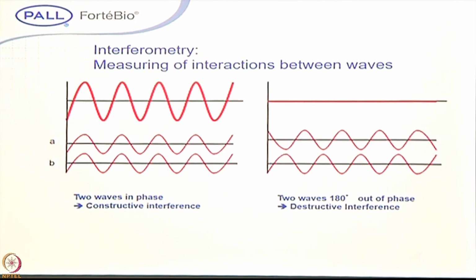The interference pattern makes the signal pattern here. As I mentioned, it works on the wave property. As you know, when the light passes through the fiber optic, there is some kind of a matrix, an obstacle. The wave hits that matrix going forward and gets reversed back. So this is the forward wave and this is the reverse wave. When both the forward and the reverse wave are superimposed together, you can see the amplitude increases. We call this a constructive interference.